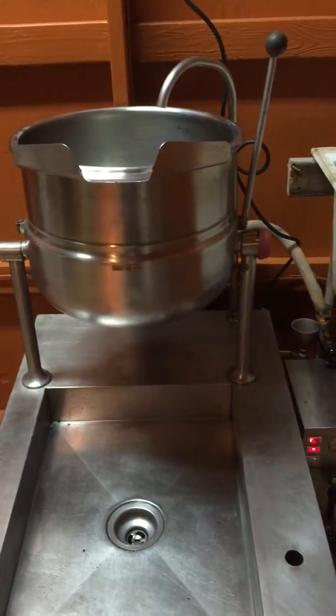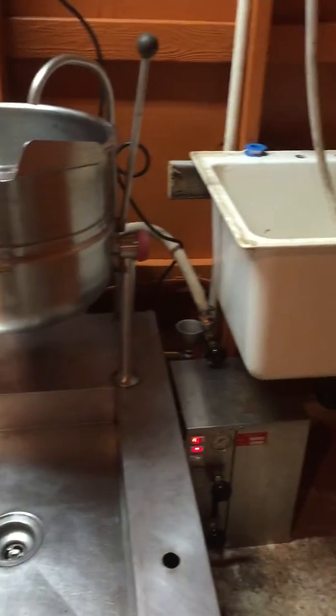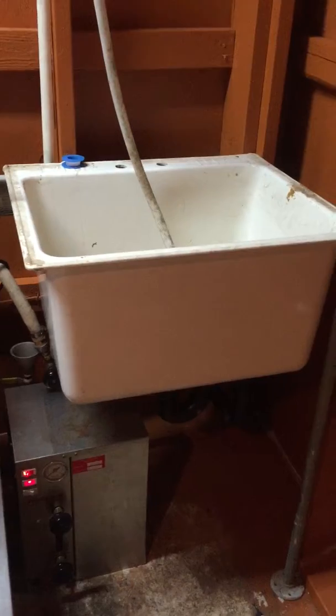All the drains are going to go into 55-gallon drums outside. We have one for the hot water for the kettle and then we have another 55-gallon drum for the sink — those are going to be our gray water system.